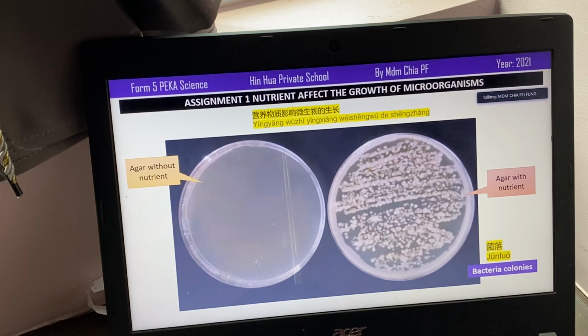So in experiment, if you are to carry out this experiment, okay, we are going to use petri dish with lid. Okay, 然后 petri dish 里面呢，我们是放我们的营养，当然是它的 situation 给奶，当然 experiment 我们不可以用奶，because 奶是液体，is a bit difficult for us to handle because it is liquid. So we will replace the nutrient in the milk using agar. Agar 是好像果冻这样子，okay? So we will prepare two sets. One is agar without nutrient, and then the other one is agar with nutrient.